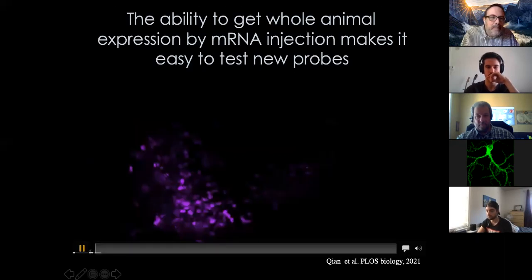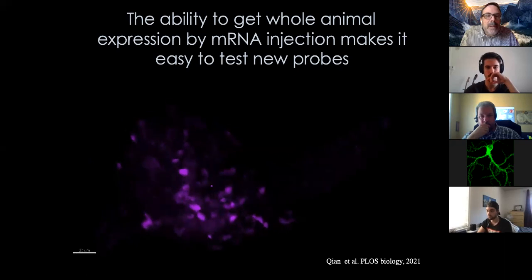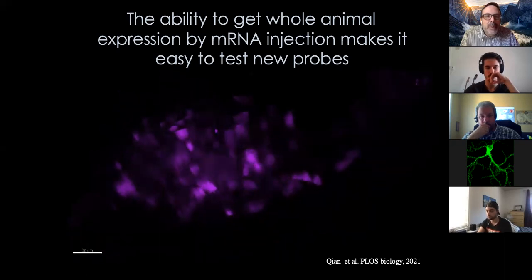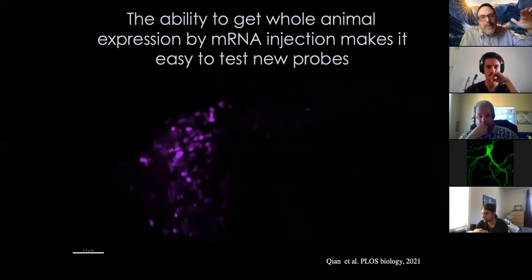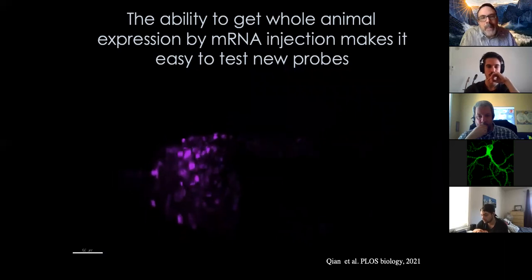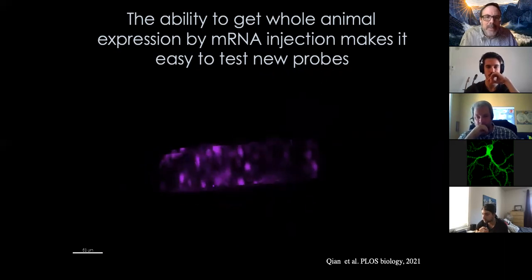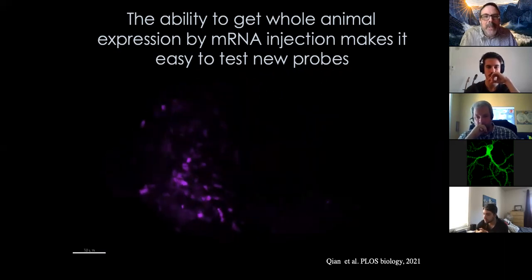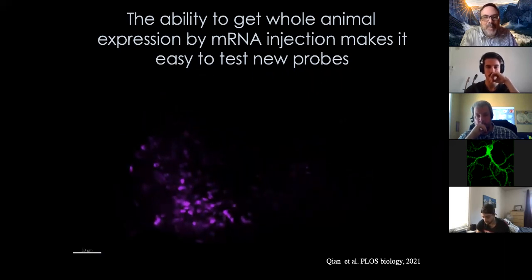You have to hit play. And so this is light sheet imaging of this near-infrared fluorescent protein. It has an interesting property of being bright in the non-calcium bound state and then getting dark when it binds calcium, which has some advantages. It has disadvantages with respect to fluorescence bleaching over time. But we were able to do all of this in under 2 weeks, from receiving a plasmid in the mail to capturing a 3D light sheet image, which I would say is almost impossible to imagine doing in a mouse.